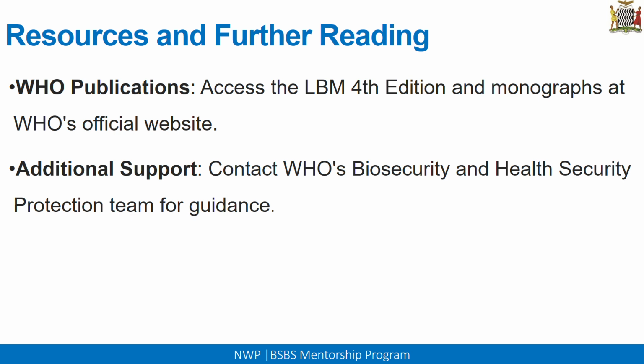Okay, so here is where you may get further resources, or where you can get more information on the Laboratory Biosafety Manual as well as the associated monographs. You can get the WHO publications, for example.